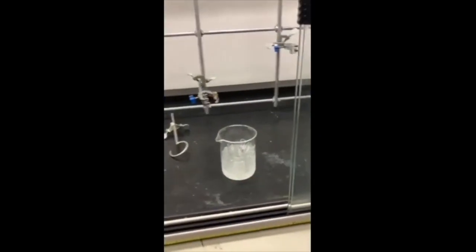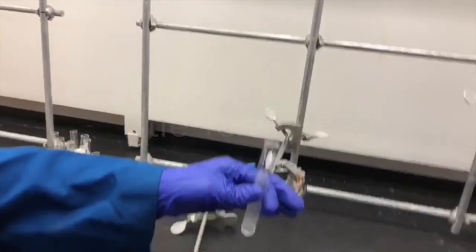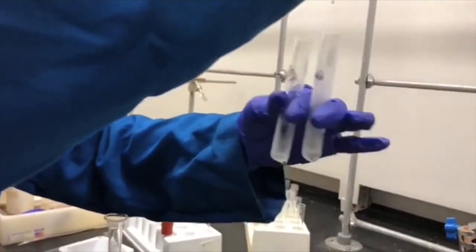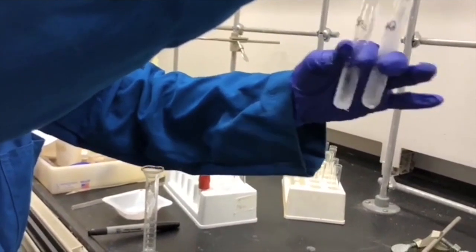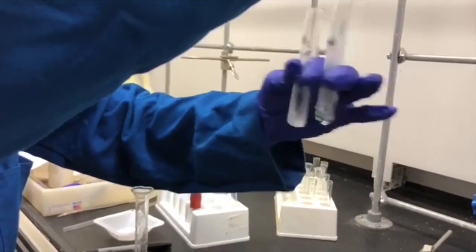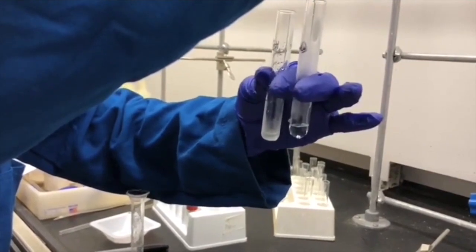And then we're going to cool both of those acids in the ice bath for 15 minutes. After it's been cooled, we're going to add sulfuric acid dropwise to the nitric acid test tube, swirling the test tube every 3 drops of sulfuric acid. So as you can see, I'm shaking the test tube every 3 drops of sulfuric acid until I've added all of the sulfuric acid into the nitric acid test tube.